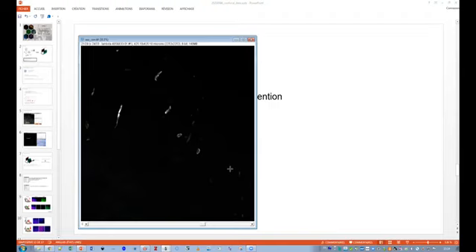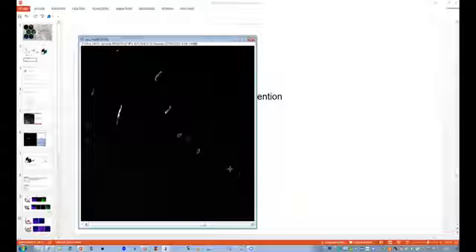It was because I did the spectra on a few pixels because for my case I assumed that the more intense pixels were maybe pure components. Are they pure? Otherwise, they are polluted by something else. Okay. But if you have only pure components in your sample, it will be easy.